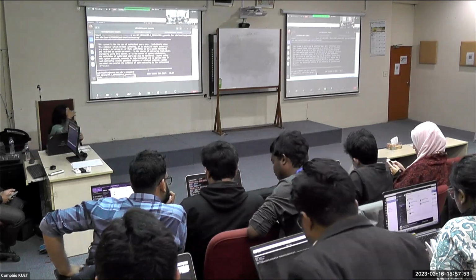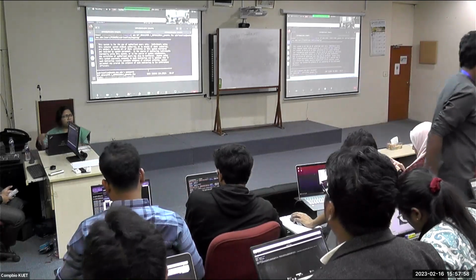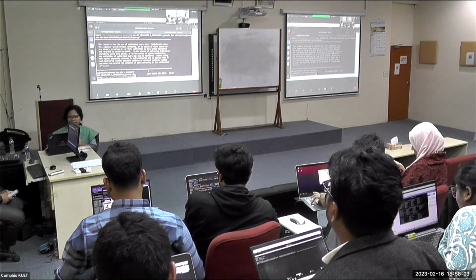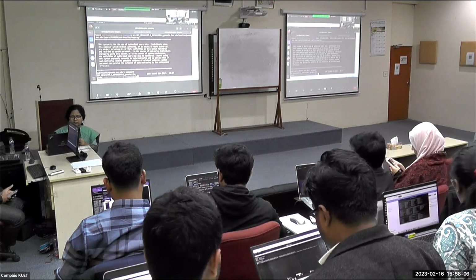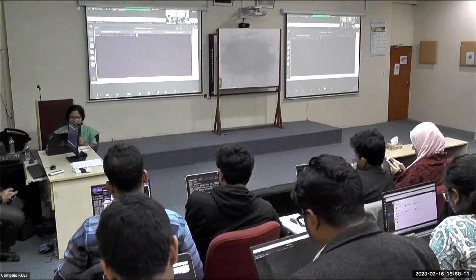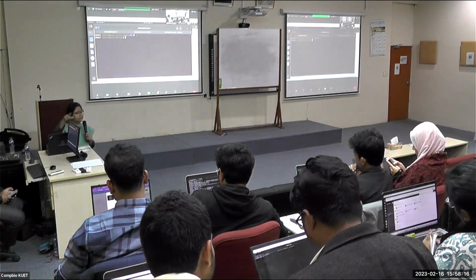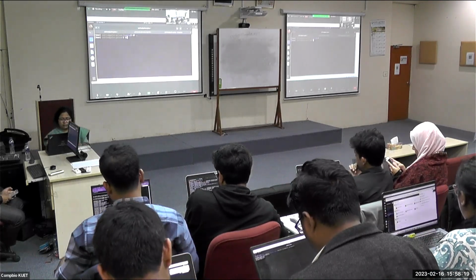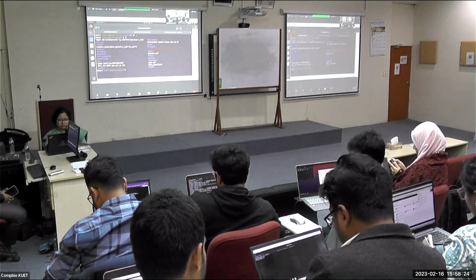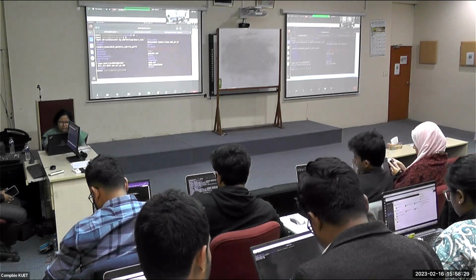Okay, so make sure that you are not in the HPC now. Make sure that you are in your computer, in your computer's terminal, like this. Maybe in the home folder. You are now in the home folder, right? That arrow sign, the wavy sign. Okay. Analysis folder.